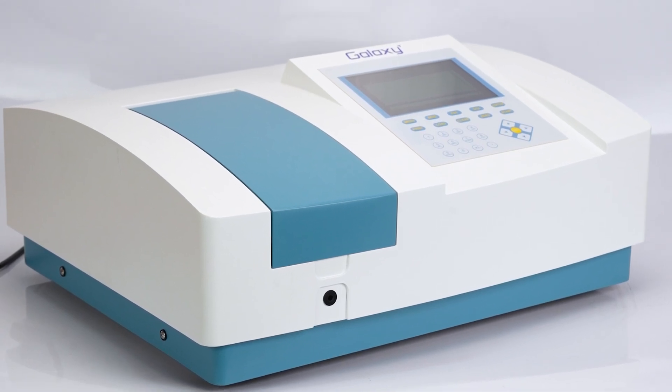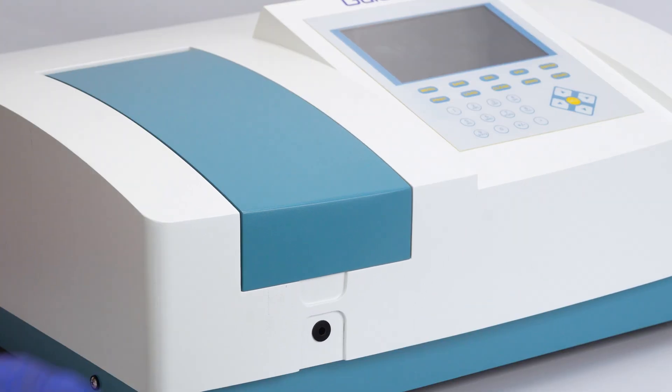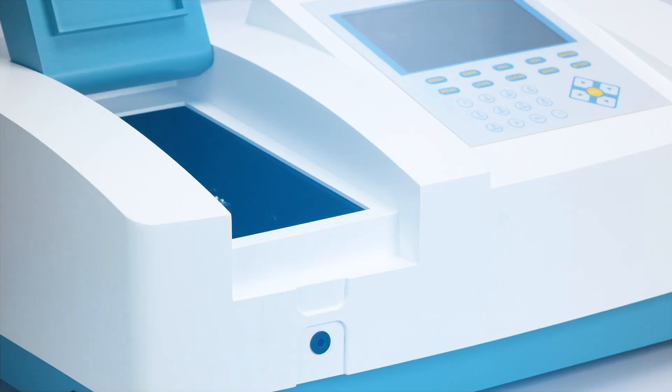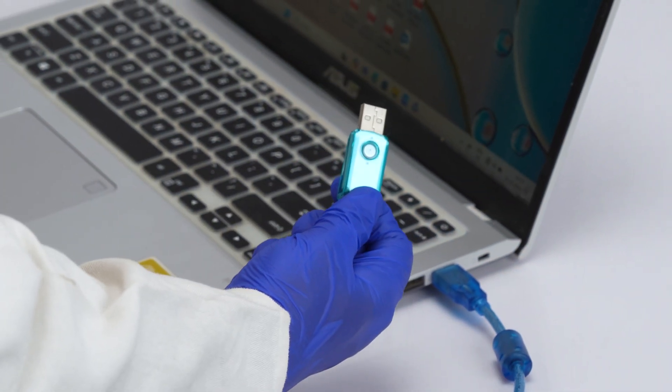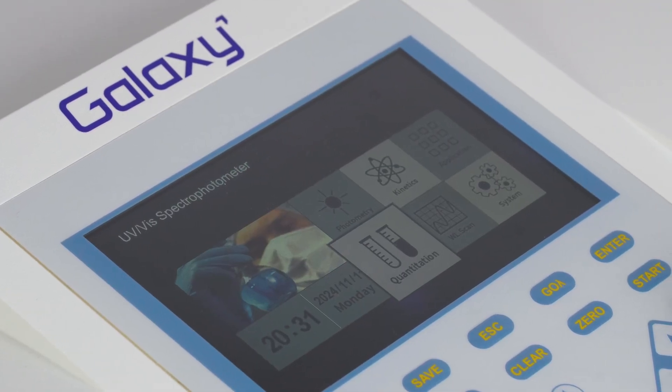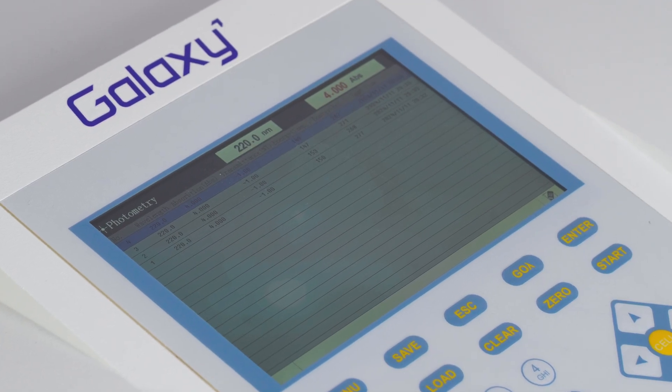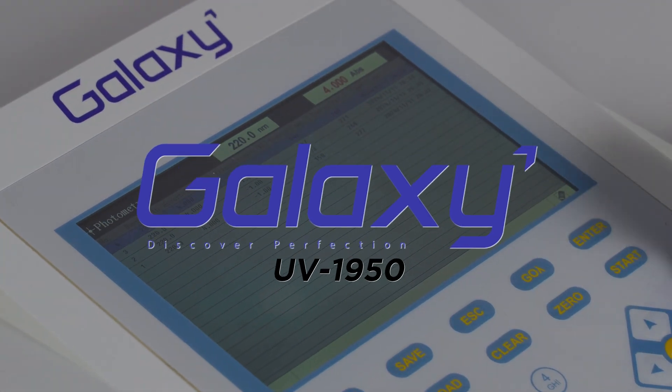Welcome to our comprehensive guide on the Galaxy Double-beam UV-Visible Spectrophotometer UV1950. This advanced device is perfect for a wide range of analytical applications offering precision, versatility and user-friendly features. Today we'll walk you through its accessories, setup and functionality to help you get started seamlessly.